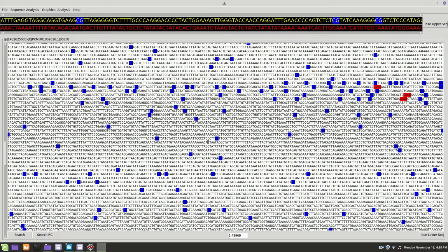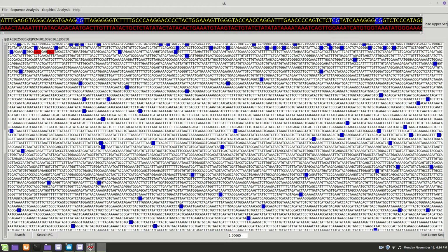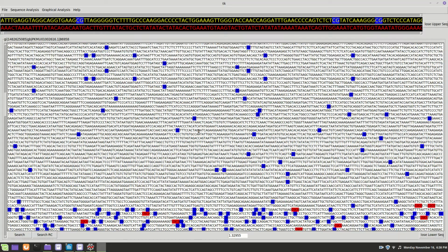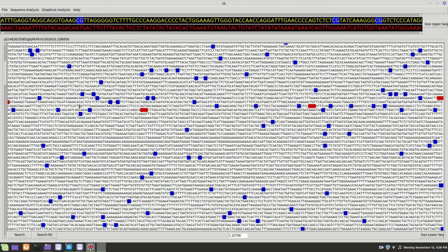But the whole idea is you need to find that for whoever has gene 3. Now gene 2, up here, another big one here. Or no, that's the one we were in. This is even longer. Doesn't have as strict or as many CGs, but definitely it's there.